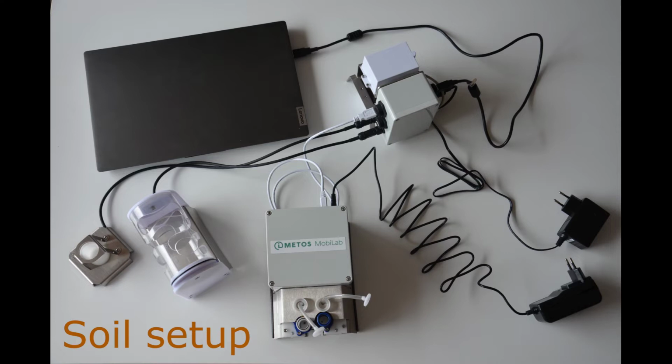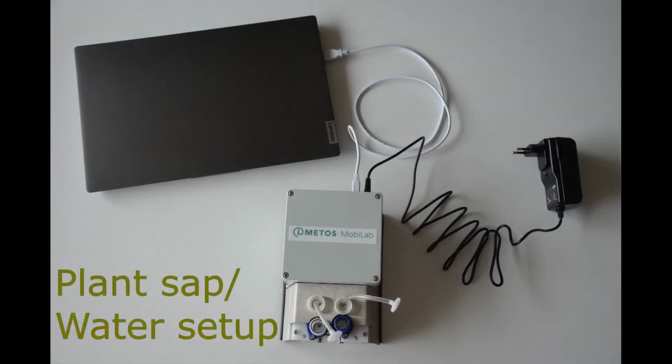This is an overview for the setup of doing soil samples. It includes the USB hub, the shaker and the scale for doing the soil preparation. For doing just plant sap or water samples, the connection is much easier and you will not need the USB hub, the shaker or the scale for the sample preparation.